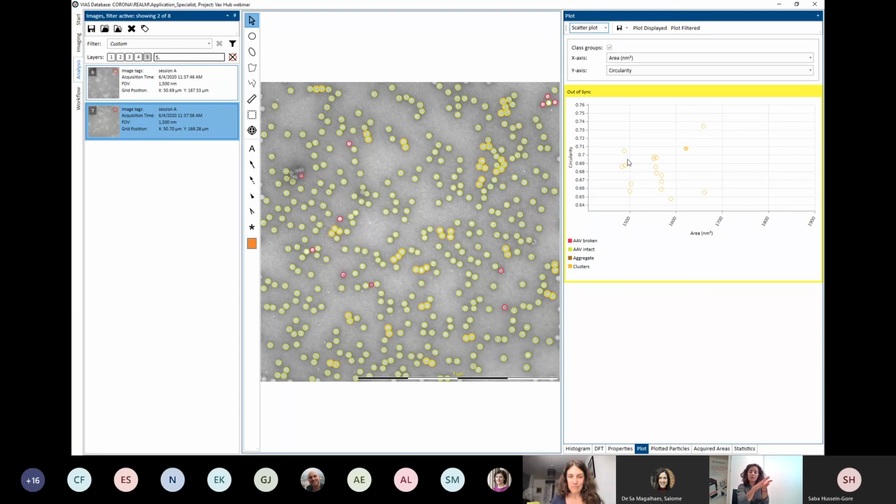So do you remember when I told you that we can stitch together images to give you a better overview? If we just want to talk about looking at these thin sections, the first thing you want is not a choppy image, but something that you can really zoom out on and look at. And we can stitch the images together. And we also use different things like template matching and so on to analyze these images in the thin sections.